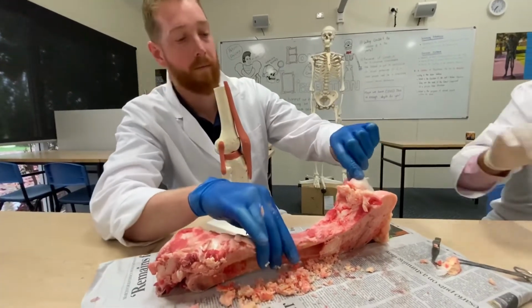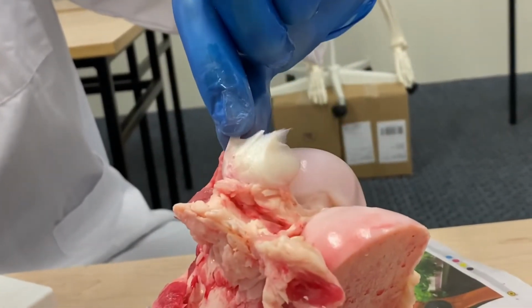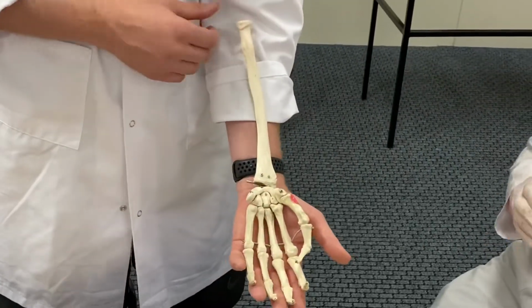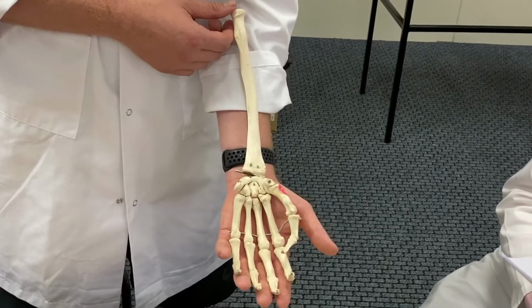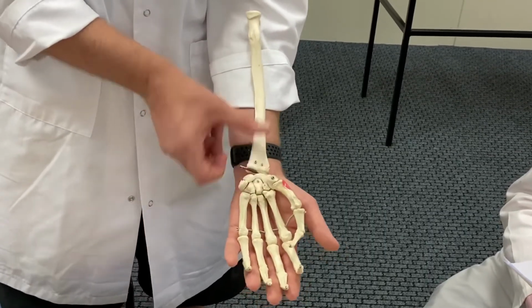Here's red, but if you look to where Mr. Cook's pointing now, you'll see some strong fibrous tissue, and that is really a perfect example, having been cut, of ligament. Let's go back to one of the key functions of the skeletal system, movement. So muscle, bone, tendon, ligament work together in splendid choreography. Nowhere is this better demonstrated than in your hand.